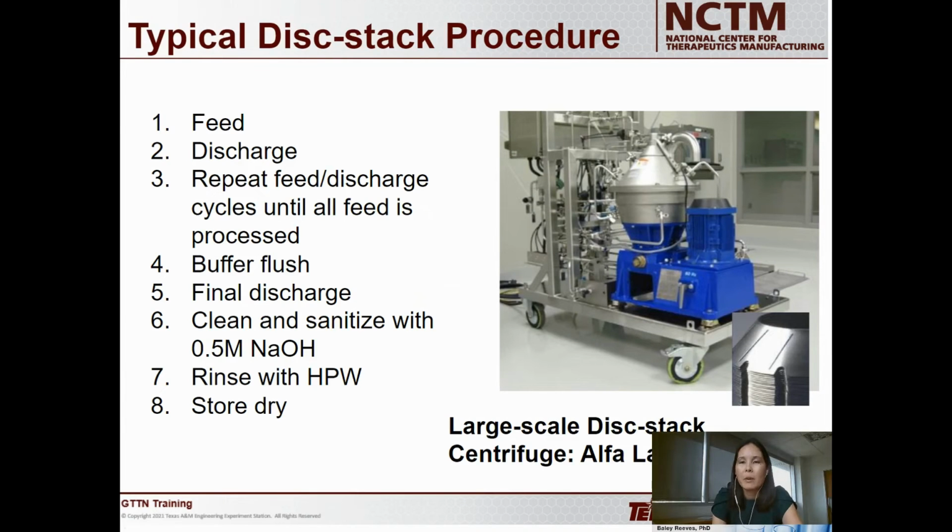This is what a large-scale centrifuge looks like. And again, in order to operate this, it's a fairly straightforward process. Essentially, you're just going to be continually feeding the centrifuge until all of your feed material is exhausted.